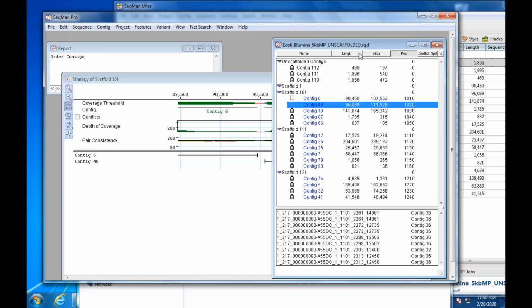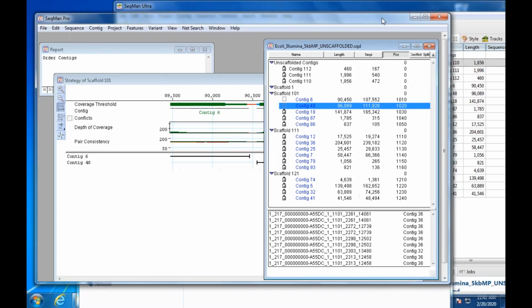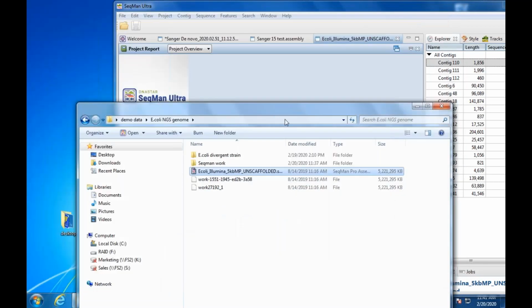So we made an improvement. The locks here, folks didn't figure that out. Really the intention is to not allow sequence data to go into these other contigs. I want to lock them down and direct an assembly to a couple of contigs. That's kind of an outdated concept, and new users we found really didn't figure out at all what that lock meant. So we changed the behavior.